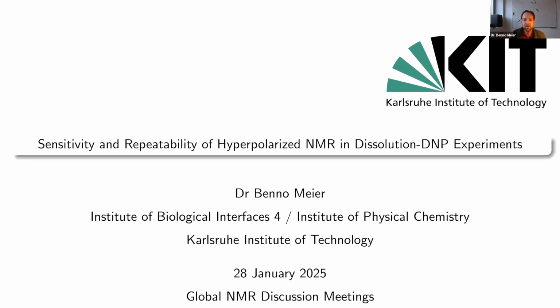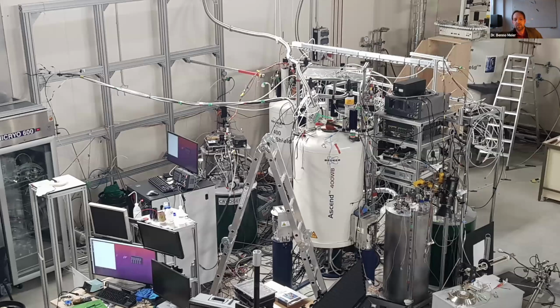Just to give you a flavor, this is a picture of our lab. And so this is basically what we need to do our hyperpolarization experiments. I'll get into the details later, but for now, you can take from this picture that there is a fair bit of complexity. And so the question is really, is it worth it?